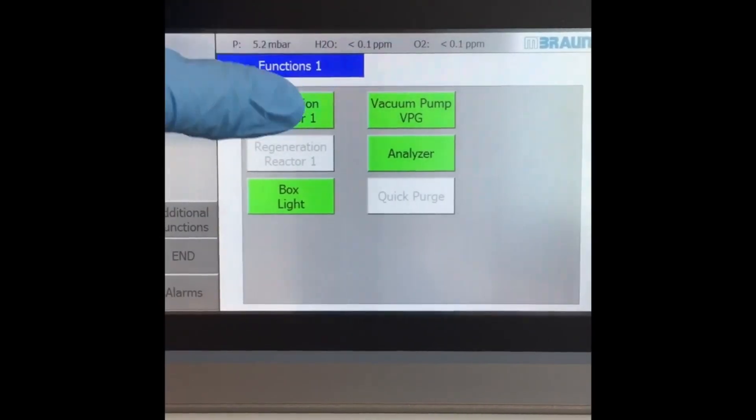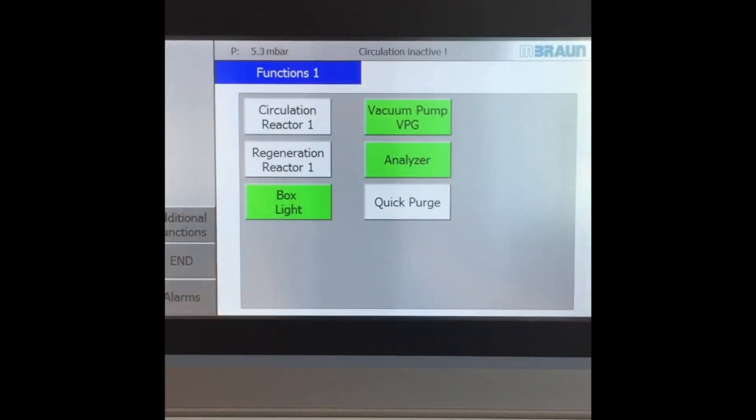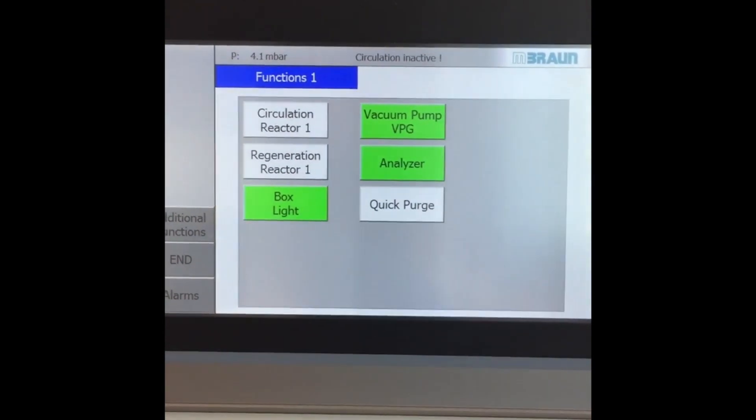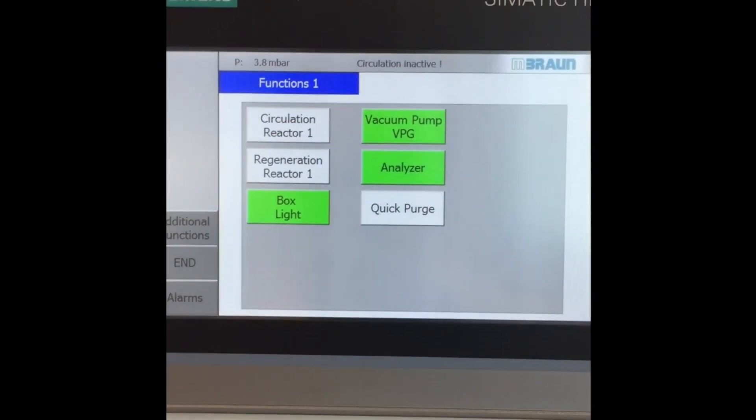If the glovebox passes inspection then the circulation purifier is turned off. The circulation purifier cycles the glovebox atmosphere through a copper catalyst to remove trace amounts of water and oxygen. The catalyst should not be exposed to solvent vapors evolved while spin coating.